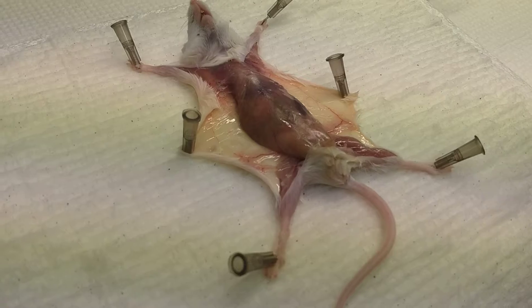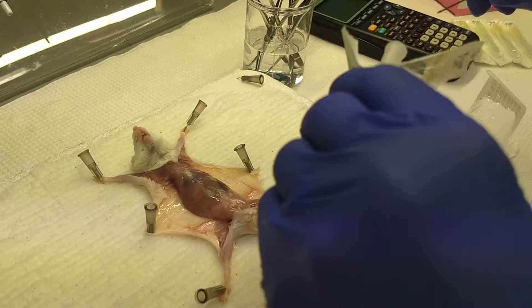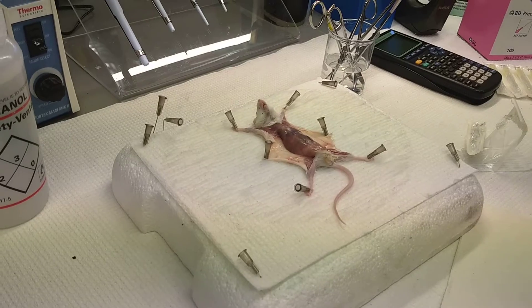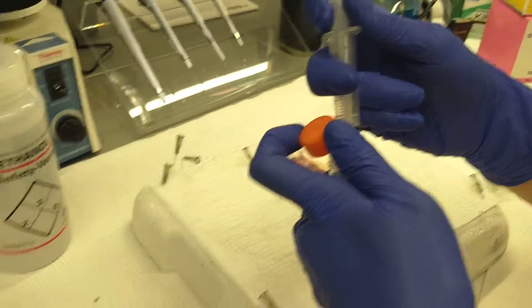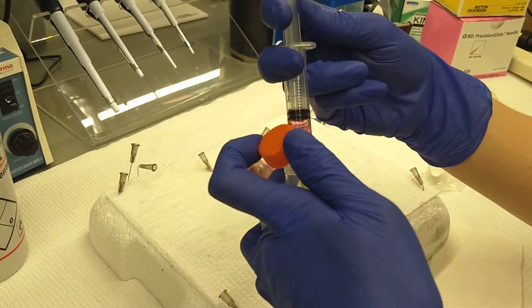Now we're going to take a 15 ml syringe and connect it to a 20 gauge needle. Then take up 5 ml of cold Clicks media — we keep the Clicks on ice to keep it cold.